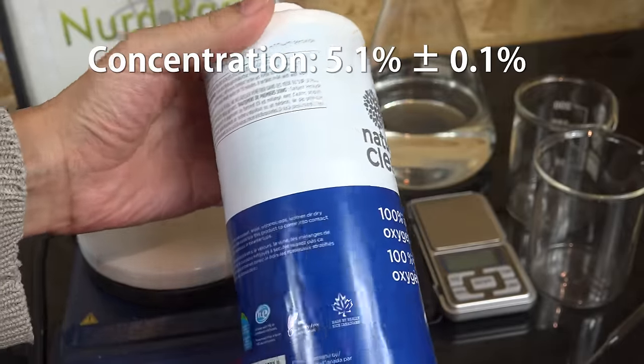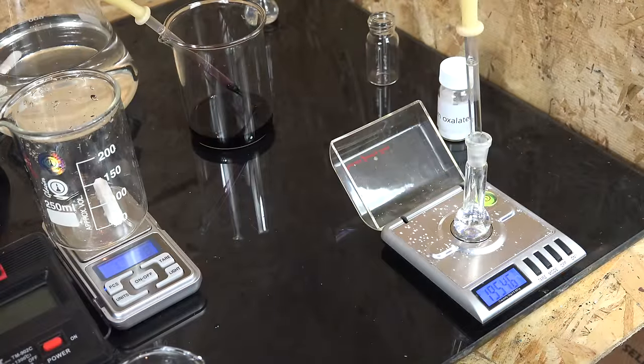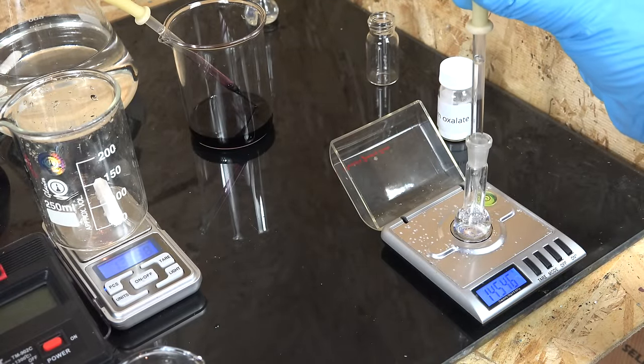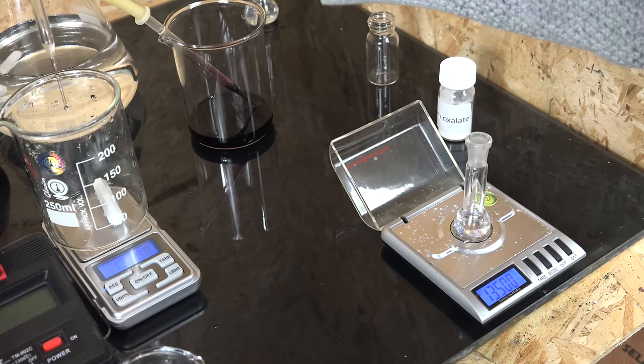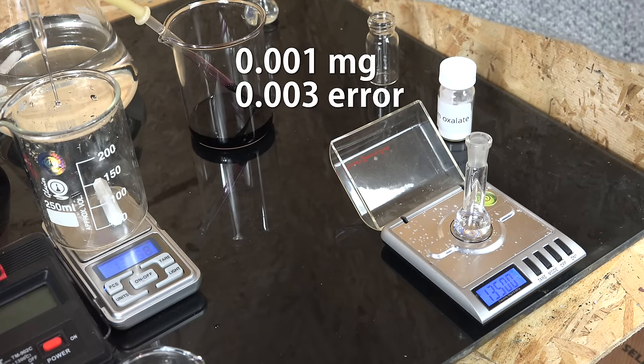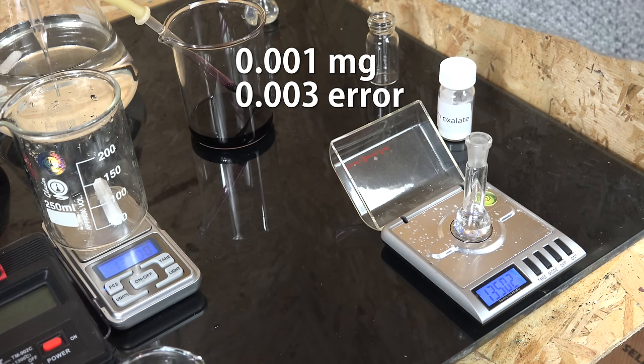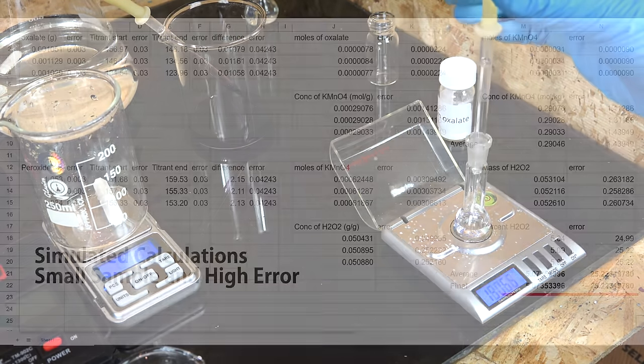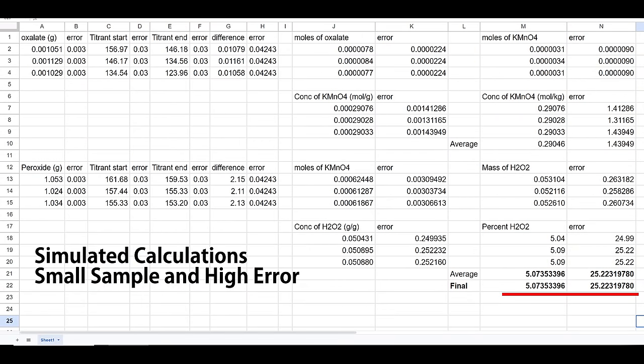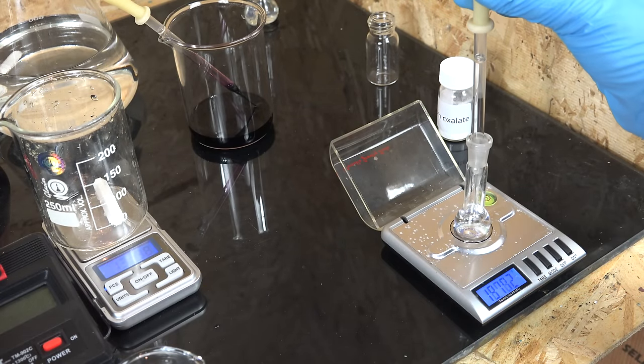Interestingly enough, error and significant figures actually help guide experimental design. You might be wondering why I picked 1 gram of primary standard or 1 gram of analyte. Why not pick 1 milligram and save ourselves time? It's because of error. Let's say I pick 1 milligram of primary standard. My milligram scale has an error of 3 milligrams. So carrying through the error propagation, our results would be completely and totally consumed by the error. Even if I got it right at 5.1%, the error would be plus or minus 15% or more. So to design a better experiment, I increase the amounts used to decrease the effects of errors on the results. And that's why I use quantities like 1 gram instead of 1 milligram.